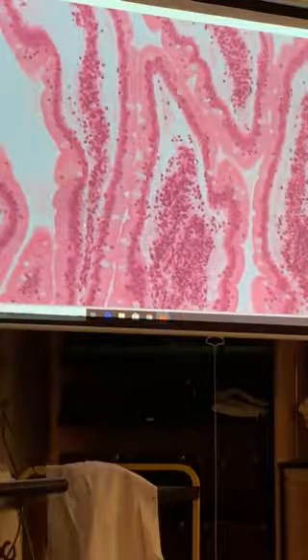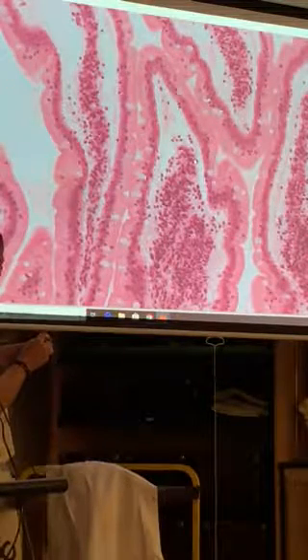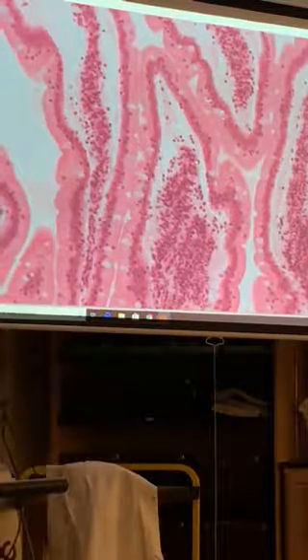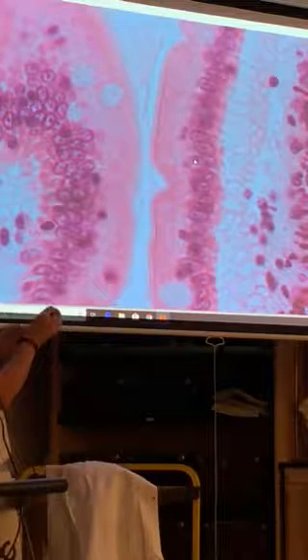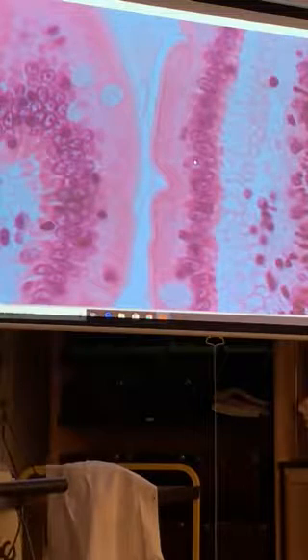All right, we're gonna look at a little tiny structure here. It's the edge. I'm pointing to the very edge of this tissue. Let's find another spot. Over here. I'm gonna zoom in on that for you. This is a tiny structure on the very edge of that tissue type. Oh, that's a good one. Let's go back. Oh, nice. Okay, so right here, we see this right here. What is that structure? Part of the cell, but I want you to name the structure.